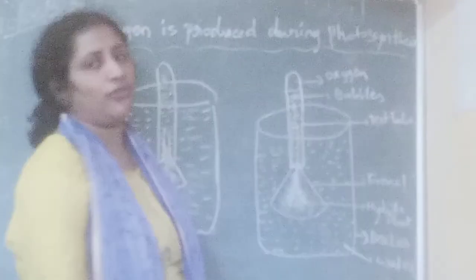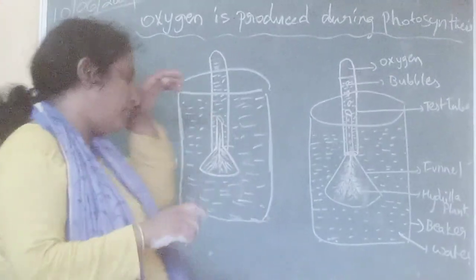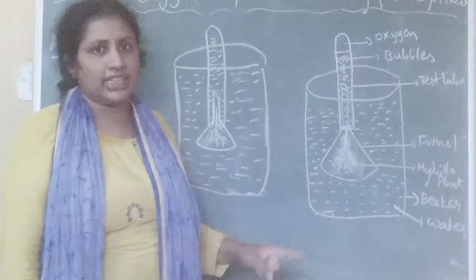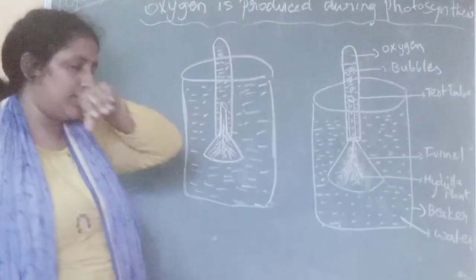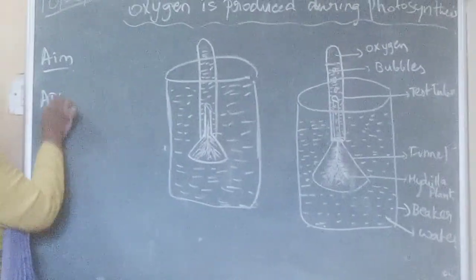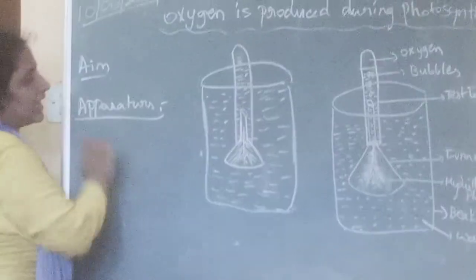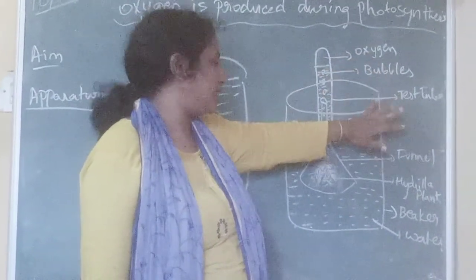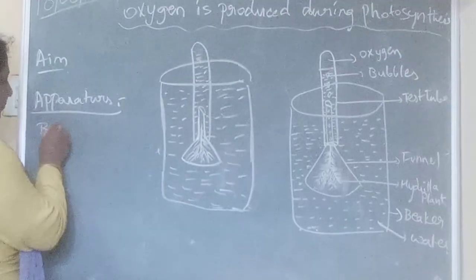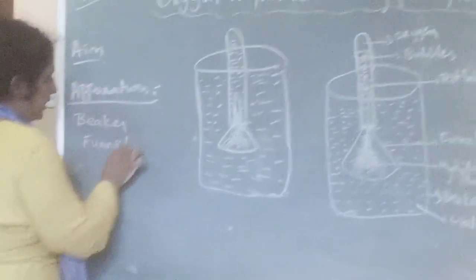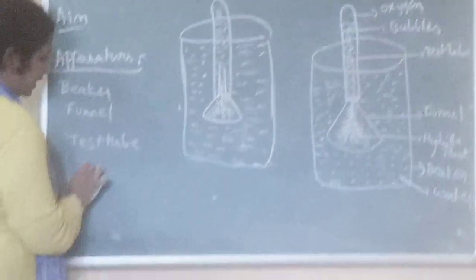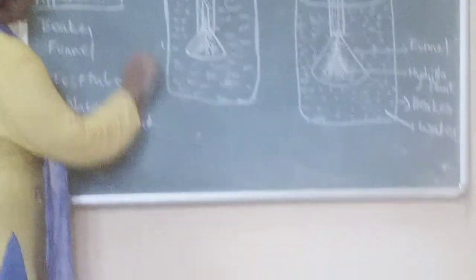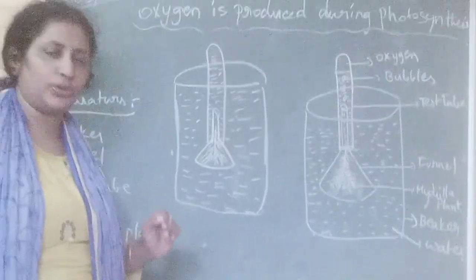To show that oxygen is produced during photosynthesis, you need the following apparatus: beaker, water, hydrilla plant, funnel, and test tube. These are the apparatus needed to do the experiment.